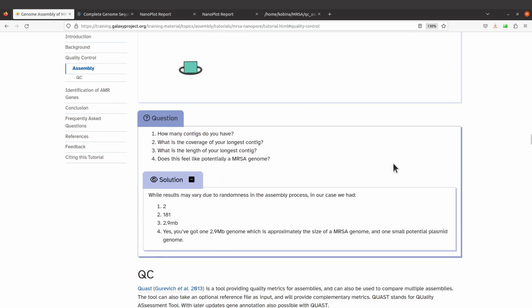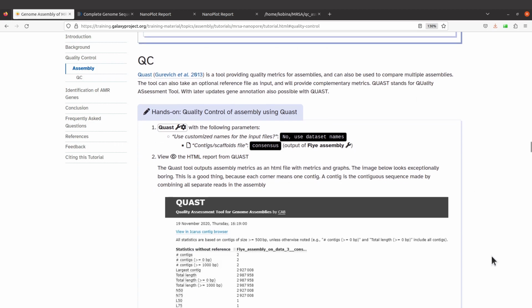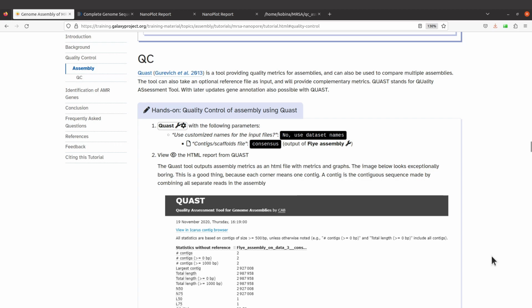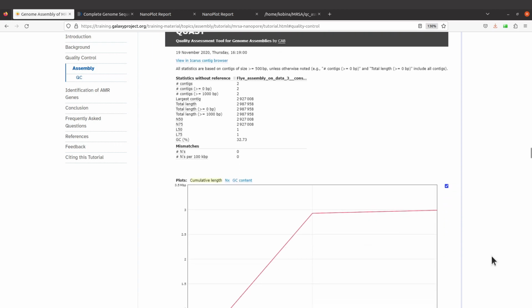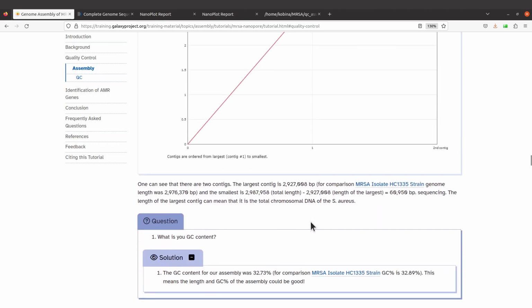And then the other thing is that for genome assembly using Flye, it's possible to do polishing while the assembly is going on. So Flye allows you to specify an option for polishing. There's a default value, but it's possible to increase it. So maybe if we had increased that number, we could have gotten something similar to what was reported here. So that is something that you also need to take into consideration.